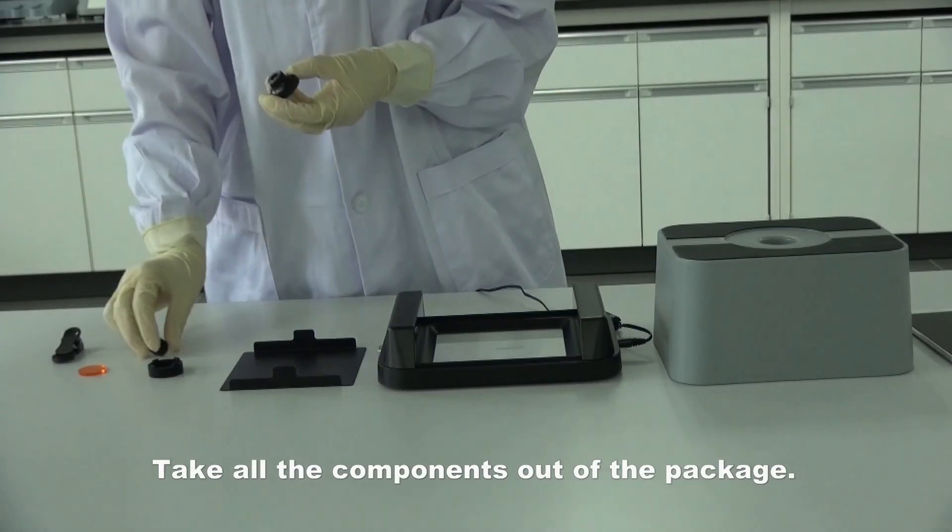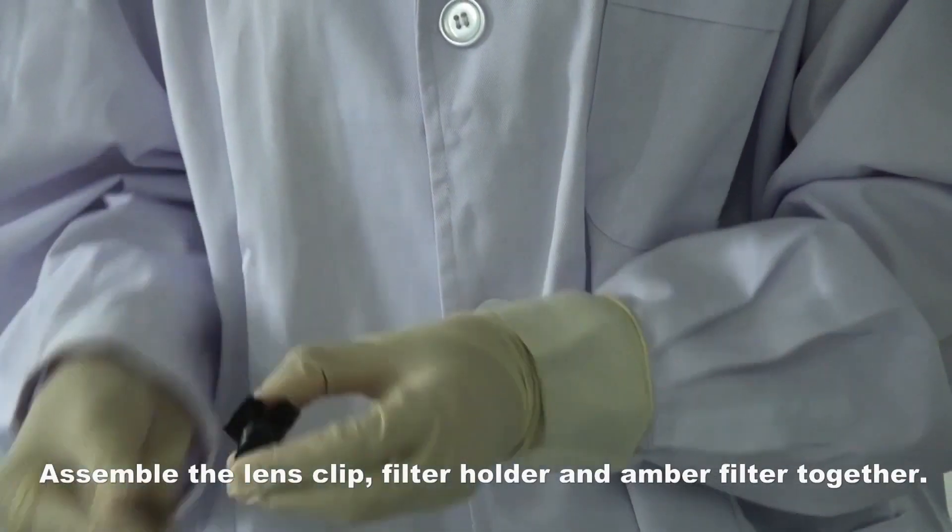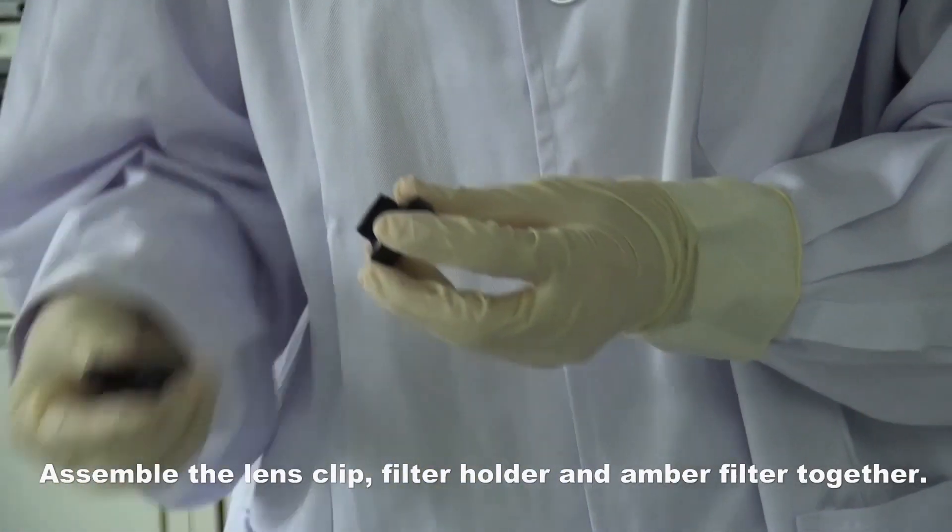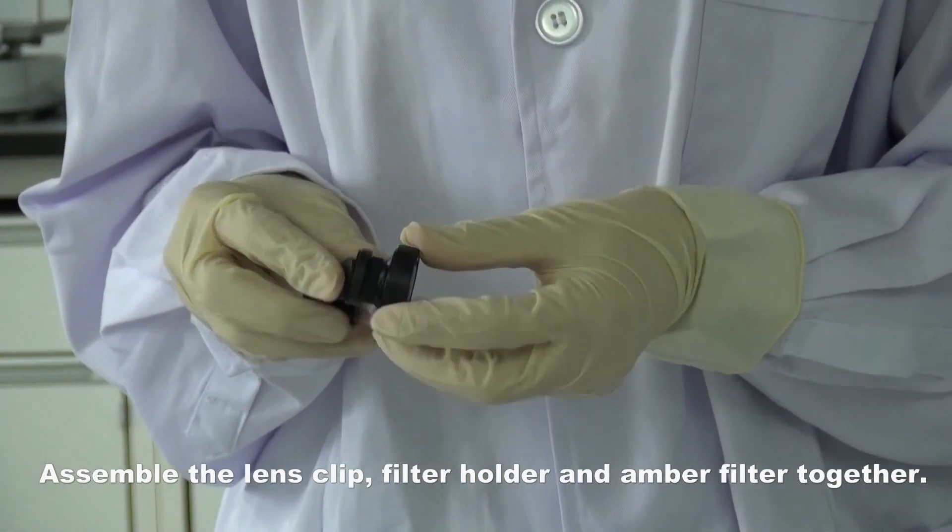Take all the components out of the package. Assemble the lens clip, filter holder, and amber filter together.